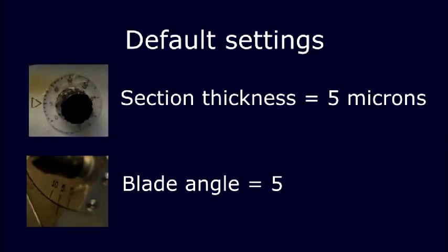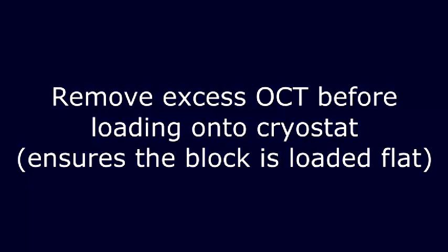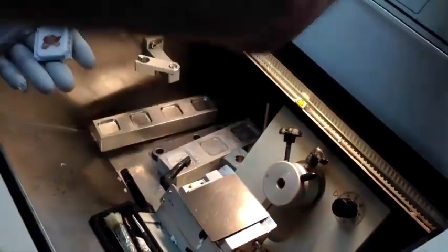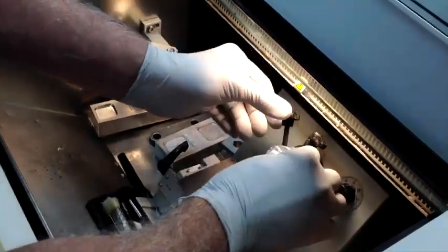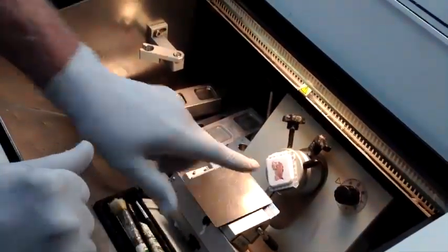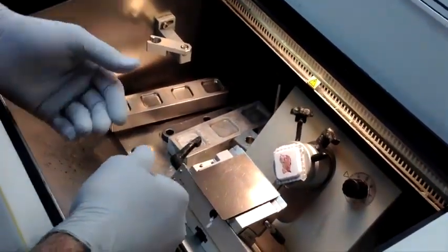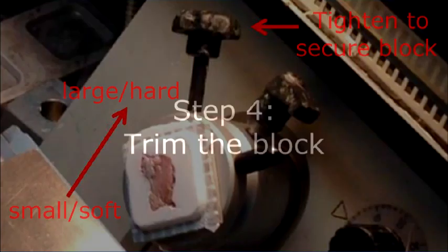This is going to be 5 microns. I took this out, I have excess OCT, I'm going to break it off and make sure it's frozen — spraying the block a little bit. I'm going to replace the block into the holder and position it to cut. I've put it at this angle because generally when you're cutting tissue, you want to cut from soft to hard, or small to large, and that will facilitate the cutting.